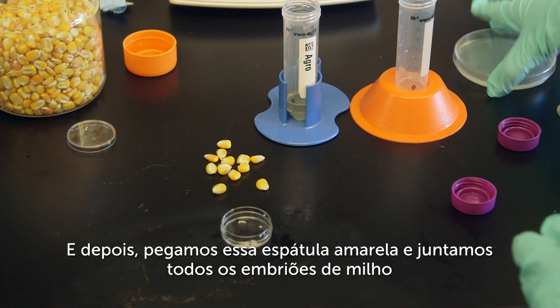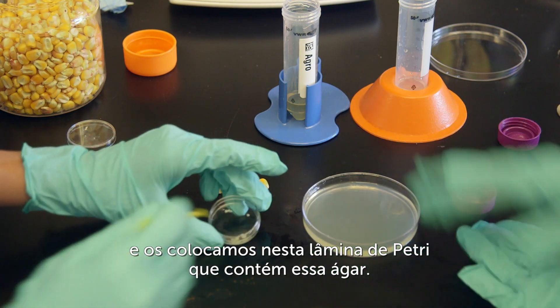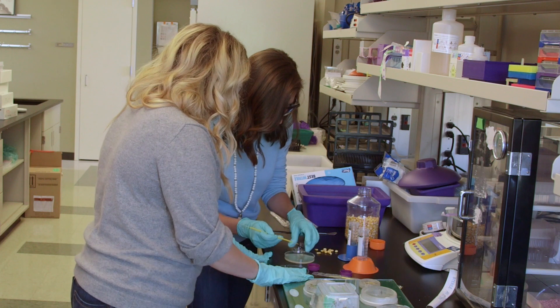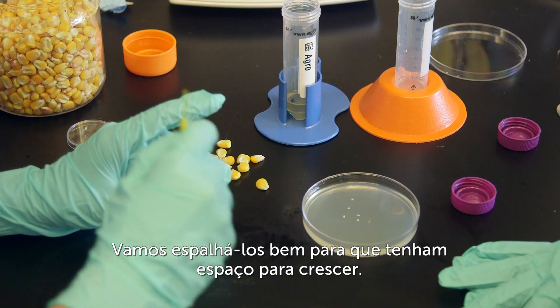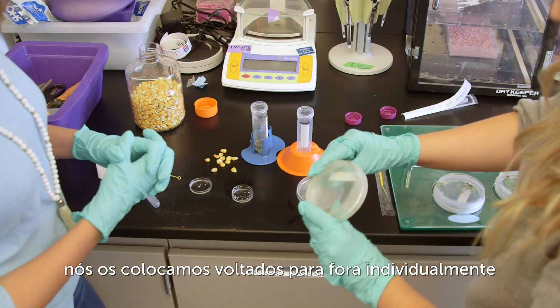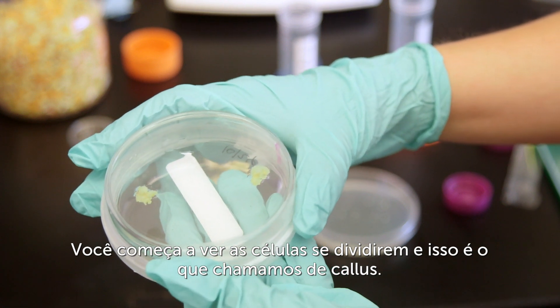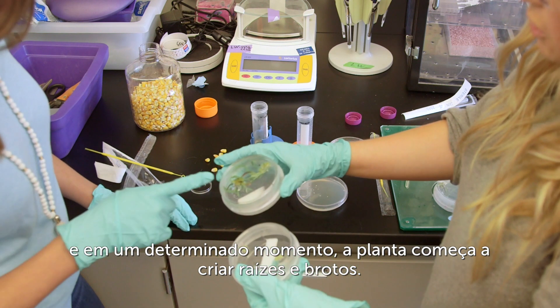Then you're going to take your yellow loop and gather all the corn embryos and put them on this petri dish, which contains agar. Agar is just going to be a growing substrate so that the embryos can start to establish roots and shoots. We'll just spread them out so they all have room to grow — spacing them out individually. This agar contains nutrients and things needed for the plant to grow. You can start to see the cells divide, and this is called a callus — it's basically just cells dividing and growing.